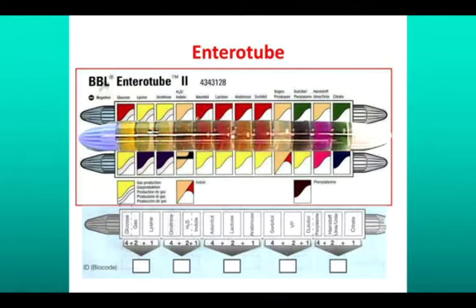Here's another tube. We'll just, again, go through this really quickly. We are positive here in the glucose test, so we'll circle that. Gas we cannot tell, so we'll leave it. Now this time our ornithine and lysine are negative, so we're going to cross those off. And we do not have a black precipitate here, and indole we're leaving as negative because we're not adding the reagent. We can look along our 4 sugars here, and all 4 of these sugars look to be negative, so we'll cross all of these off.